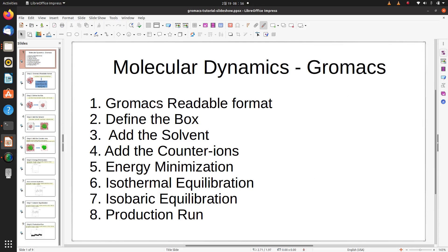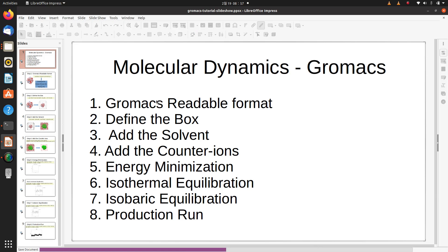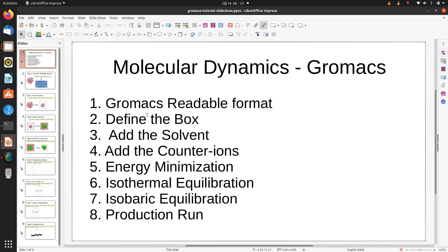Hello friends, this is Dr. Tanush Sharma, and I made this tutorial for GROMACS molecular dynamics. In the first step we will convert the PDB into GROMACS readable format.